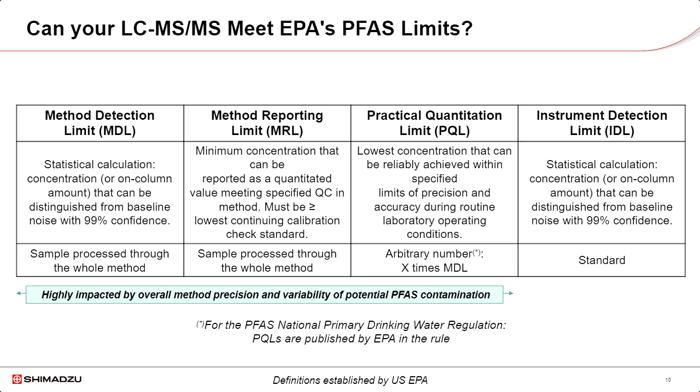Two important things about this. One, MDL, MRL, and PQL are more impacted by the overall method performance because we use samples that go through the full analytical method to calculate them. And second, if you want to learn more about how to manage PFAS in the background in the laboratory, I invite you to watch the webinar number 1 of this PFAS in Focus series that Landon presented on December 5th.